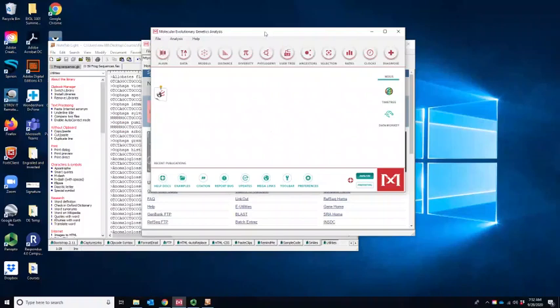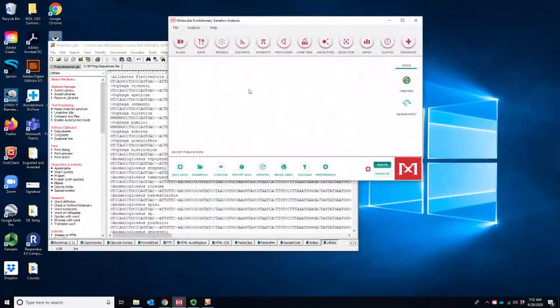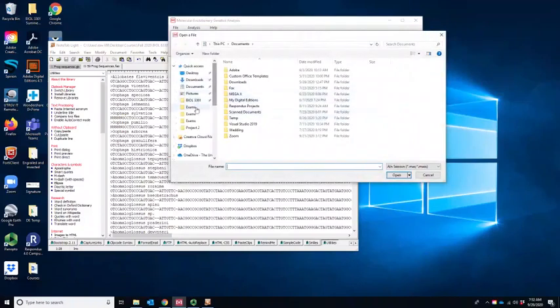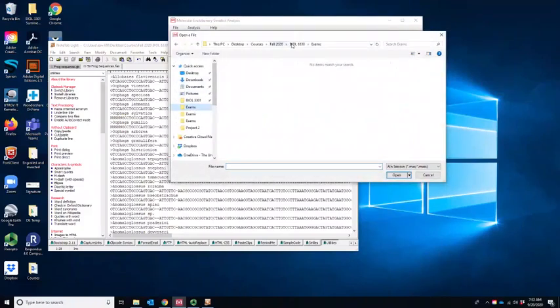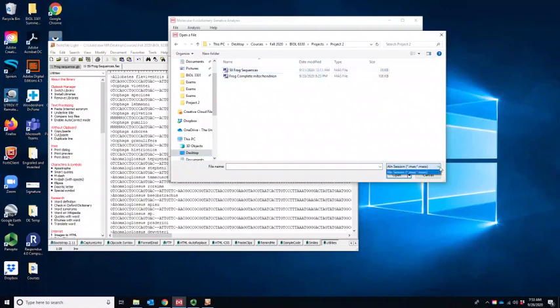So once you've done that, you open Mega, and this is the main Mega window. You can either do File, open a recently used file, or you can just do Align, open a saved alignment session. And then all you have to do is navigate to wherever you have it stored. So I've got it stored in this folder here under our projects. Project 2, here it is, 59 frog sequences. That's a .mas, but I think we might need to load it.